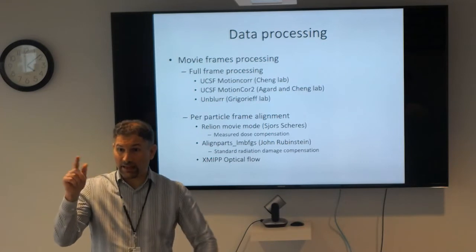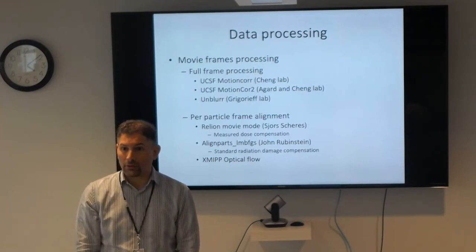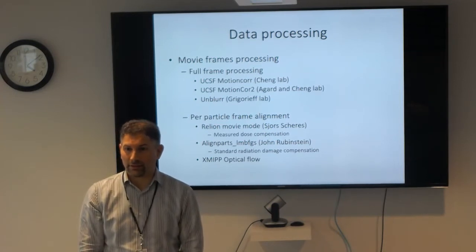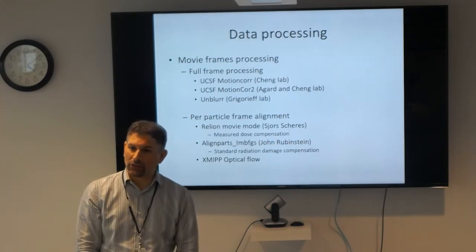You start saying spiky class averages. Right, sometimes. Or there are some mediocre classes, where something is clear, something is not. And then usually Relion would just say throw them away. Just keep them when you see clear ones. So how does Relion tell you to throw it away?